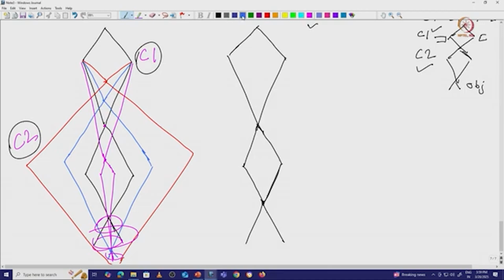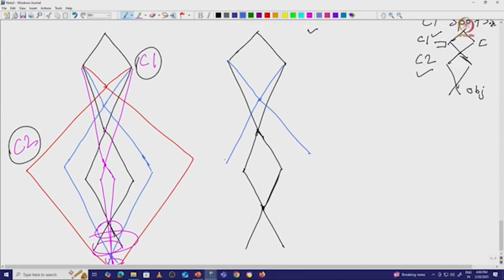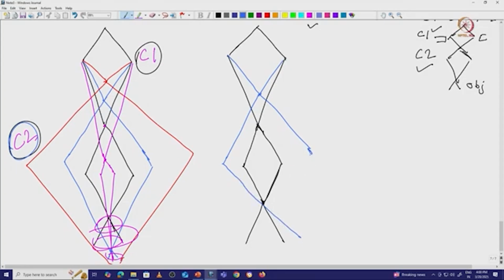Now, there is a second ray. If there is a crossover point here, it will spread the beam, and when the beam is spread we need some extra care with the C2 lens current. We have to increase the C2 lens current so the rays can go through this particular center. So it is going through this one.